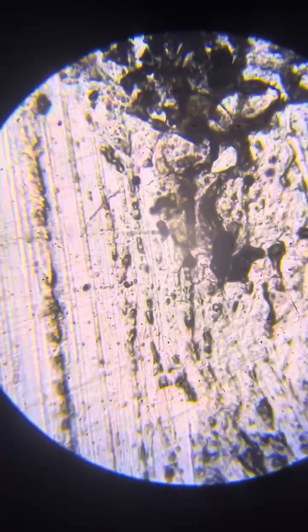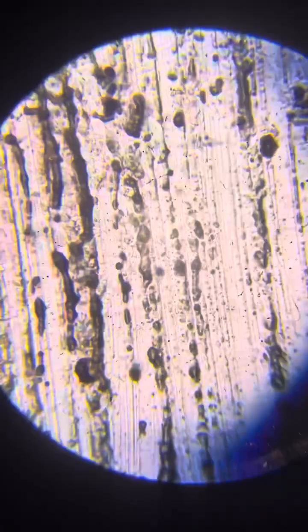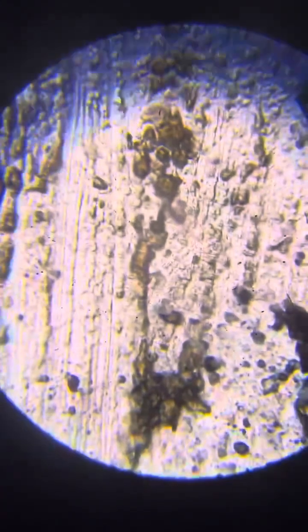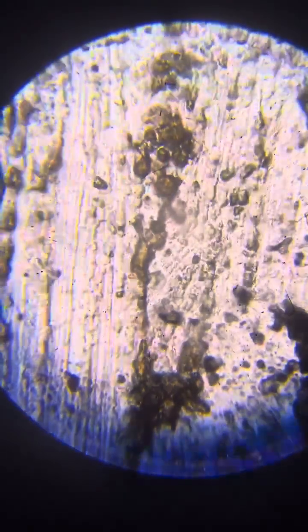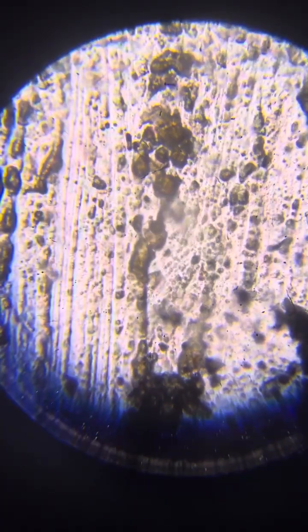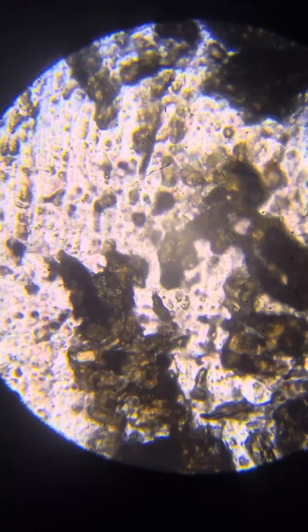We almost see nothing here, but this might be because of the composure. It's not smooth, it shouldn't be that way. You see the lines of how it was constructed. It might contain many neurons that are just, it's not like a properly created slide. Maybe I'll try to create another slide, and add a drop of water or a drop of oil, because like that it's difficult to observe anything.